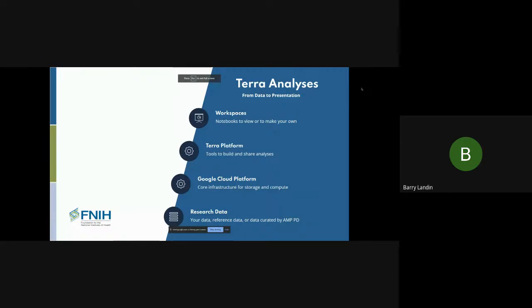So AMPD has done an amazing job pulling together all of the omics resources with the clinical data and combining research data from 8 different cohorts. But when we did this, we also threaded the same participant identifiers and naming conventions through everything, so that you can combine the data very easily in analysis notebooks and workflows.